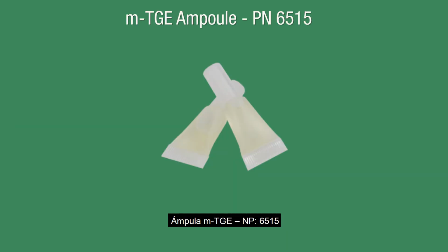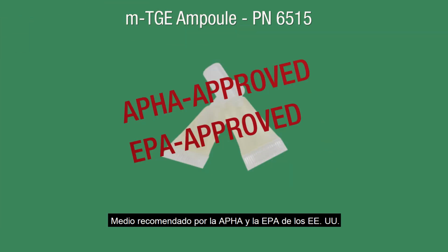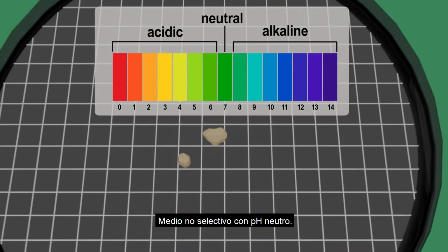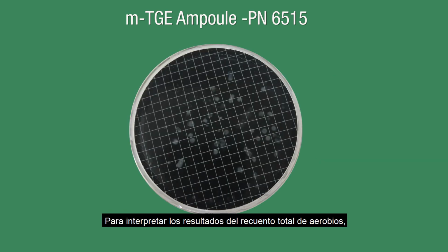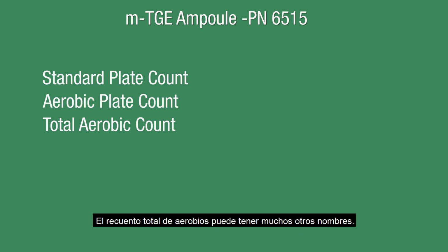MTGE ampule. APHA and US EPA recommended media. Non-selective medium with neutral pH. Size, color, and morphology vary between organisms. To interpret results for total aerobic count, record all recovered colonies. Total aerobic count can have many other names.